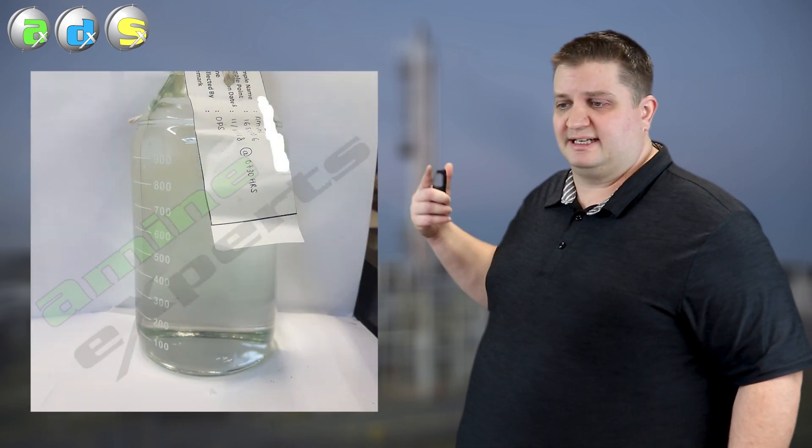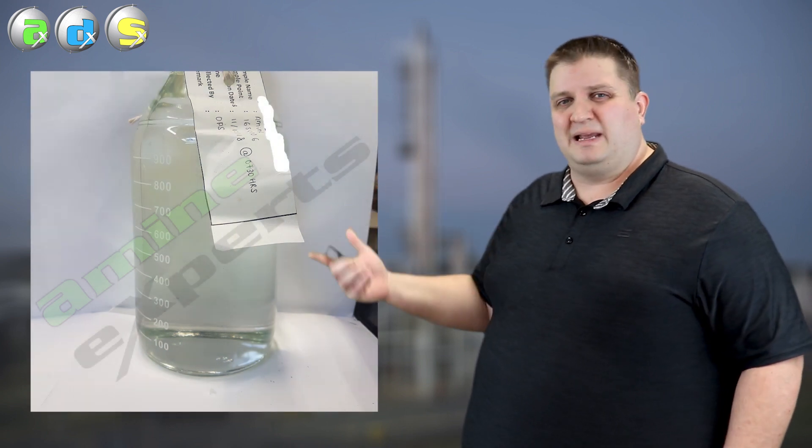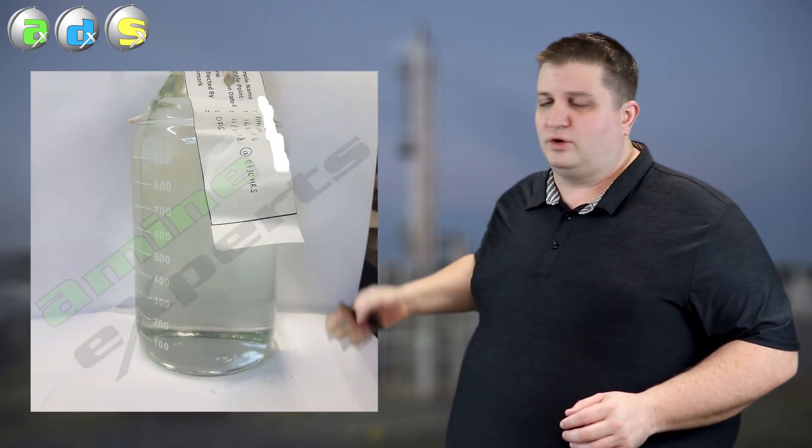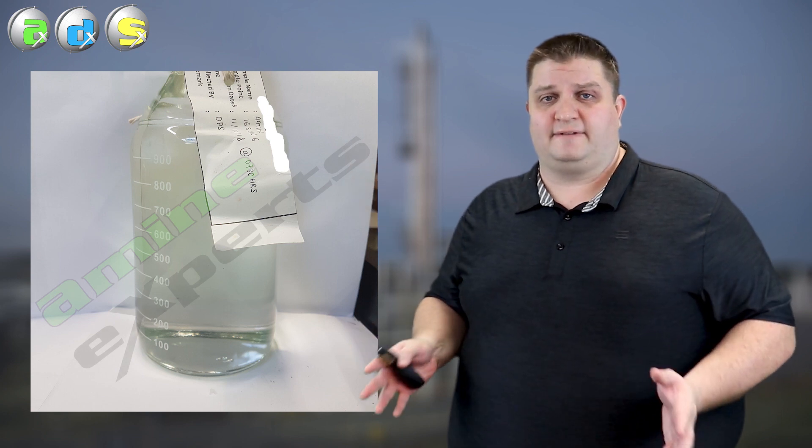Once you get that sample there's two types of analysis we can look at. There's the on-site testing and there's the off-site analysis in which you're going to get a full look at your amine. On-site the very first thing we're going to look at once we have that sample is what does it look like. What you hopefully are going to see is this right here, a nice clear amine, maybe a slight tea-ish color but overall everything looks quite fine.